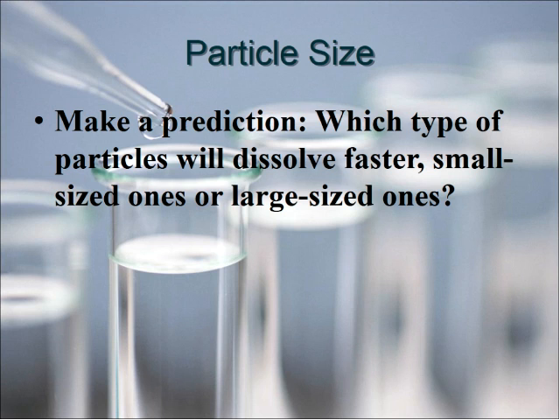We're going to talk about the particle size. Now, you're going to make a prediction on your paper in front of you. You can write on the back; it's blank on the back of your lab sheet. Which particles do you think will dissolve the fastest?